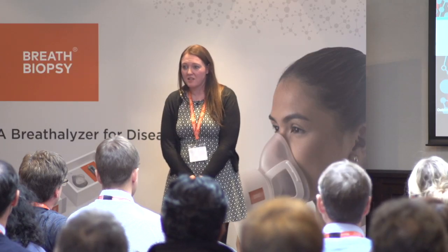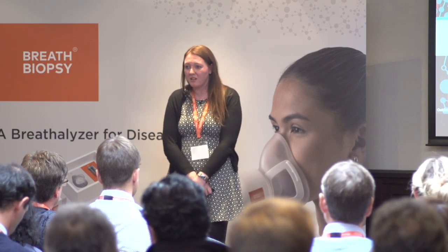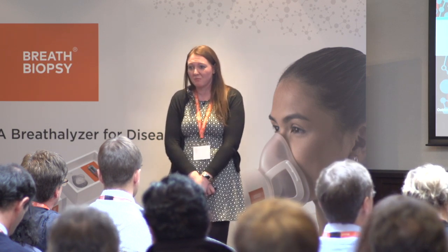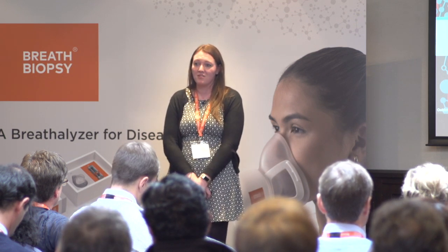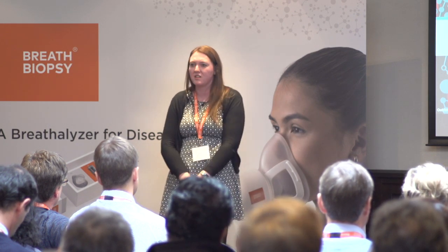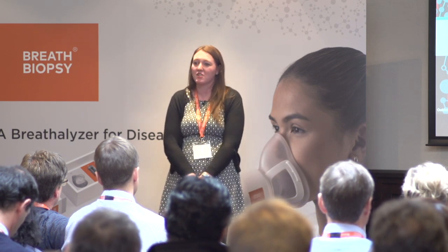Currently there are 50 compounds on the list. Addition is going to be an ongoing exercise based on study requirements. If there's anything we'd like to add, the creation of that library so far was 2 to 3 days worth of work. It's not a difficult process for us. So we currently have 50 targets. I believe 30 odd are shown on the list at the moment. It's going to be an ever expanding library.